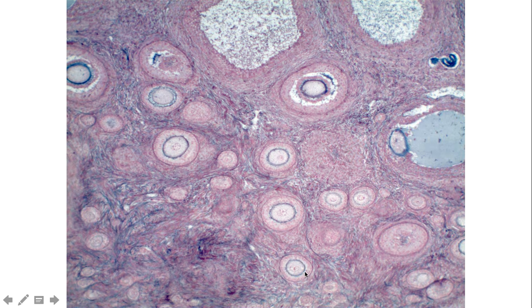If it is a primary follicle, which this one is, there will be several layers of granulosa cells that surround it. This ring of cells here is probably two or three cell layers thick. These are the granulosa cells. So those that have the oocyte with the zona pellucida and then a few layers of cells surrounding it are all primary follicles. These all right here would represent primary follicles.